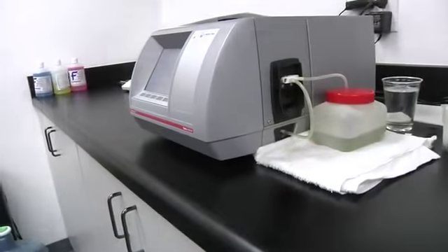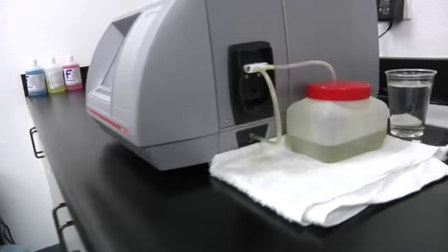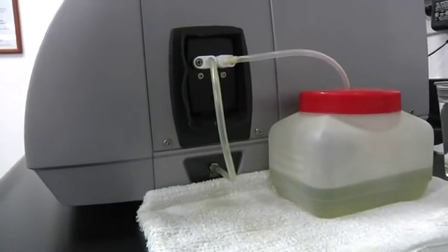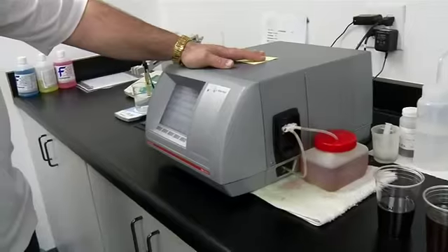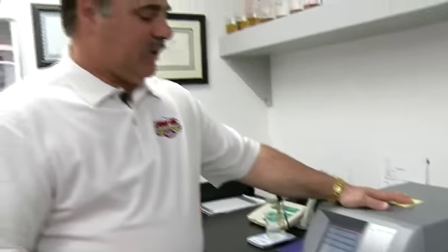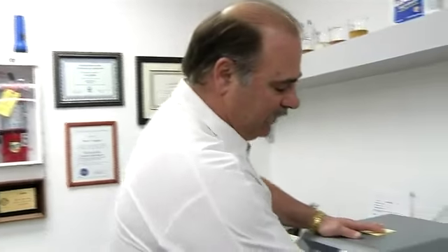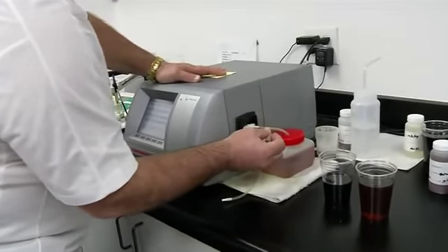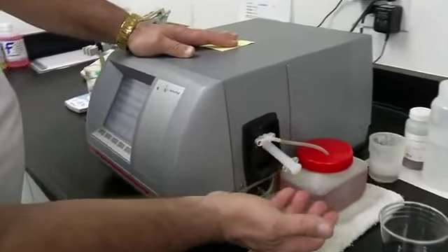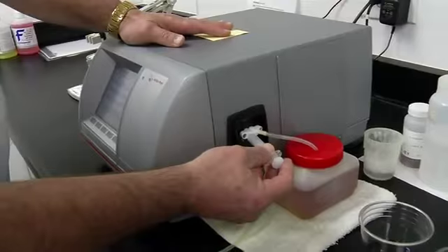This instrument here is referred to as a tabletop density meter. This gives us measurements on density, API gravity, and specific gravity, which is just grams per milliliter. And this is an important test for when we're running product out on the production line. Everything is in milliliters, but we have to convert that over to grams when we fill product. It takes about 5 seconds to run this test. You inject the product into this port, and about 5 seconds later it gives you an actual density reading.